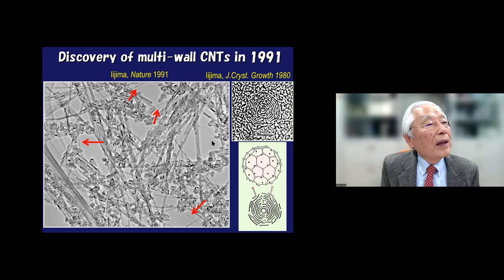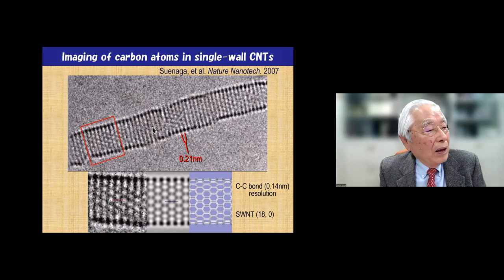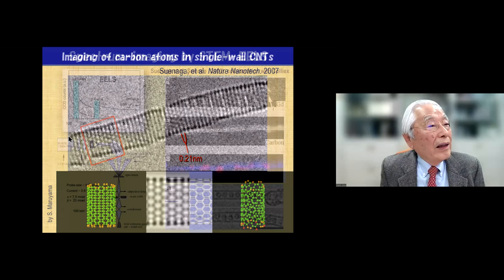Then after that, this was done at the NEC laboratories, and Professor Suenaga joined us, and we did a lot of work using carbon nanotubes. This is one of them. And now we can see individual carbon atoms. This is also using carbon nanotube.